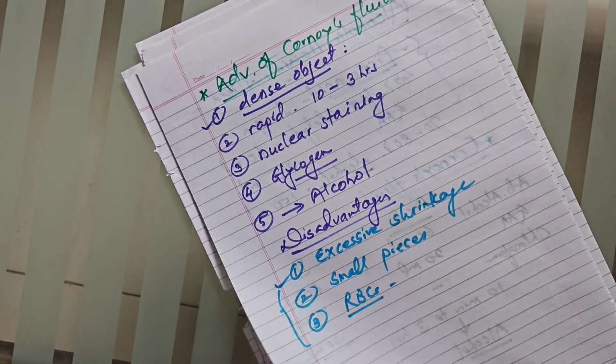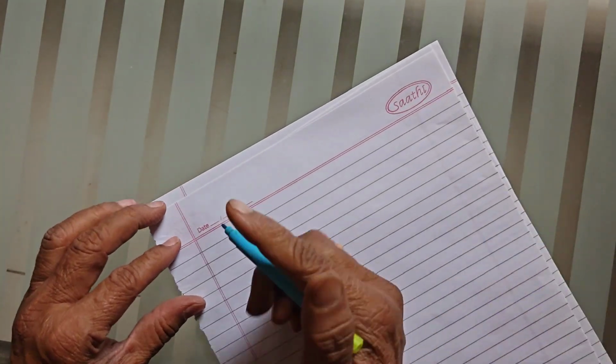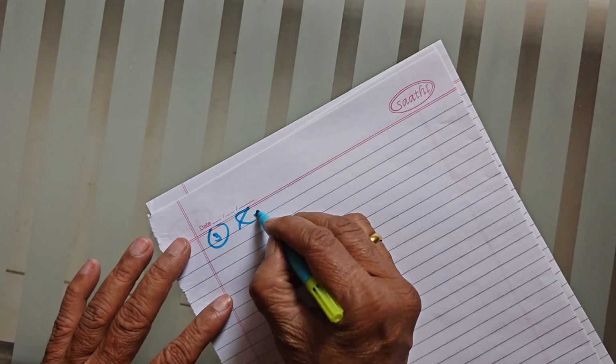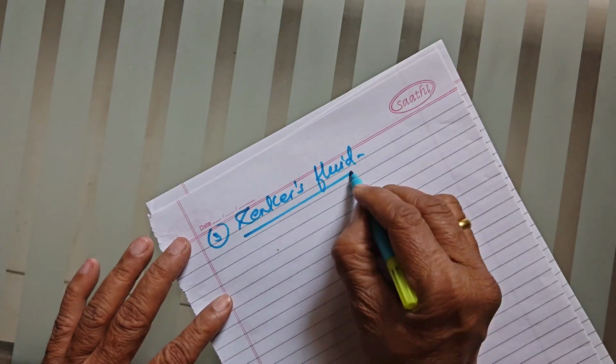Now, the third fixative is called Zenker's fluid.